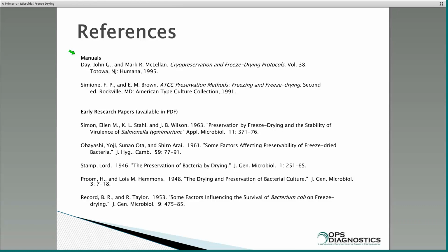Now in doing that, my objective normally is just to preserve cells for a culture collection. So I'm not trying to develop a process or anything. Certainly if you have a very dilute culture, you could spin it down and bring them up in, let's say, 1/10 the volume. You certainly can concentrate your cells.